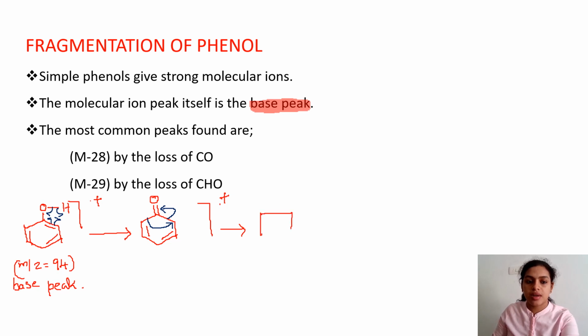Phenol has 6 carbon atoms. Now it has reduced to 5 carbon atoms and the bonds are like this. And there were 2 hydrogens here, with no change for those, and dot plus remained on the outside. The change here is the elimination of carbon monoxide, a neutral molecule, and as a result dot and plus remain on the molecule itself.